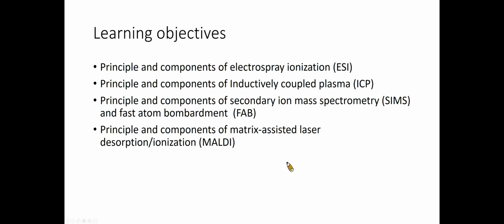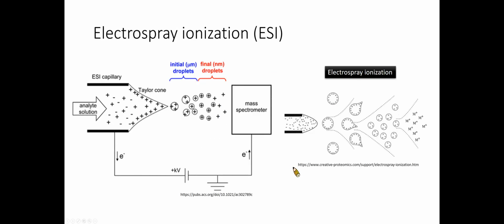In today's lecture, I will navigate you through the second part of sample ionization techniques. You will learn the principle and components of electrospray ionization, inductively coupled plasma, secondary ion mass spectrometry, fast atom bombardment, and matrix-assisted laser desorption or ionization.